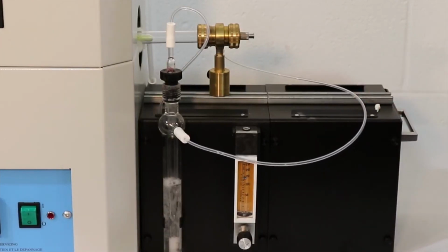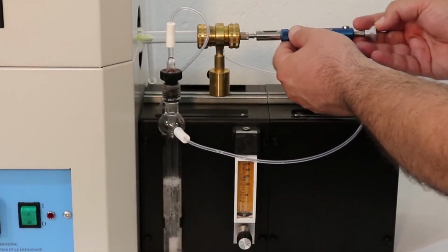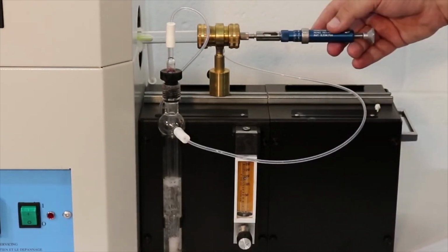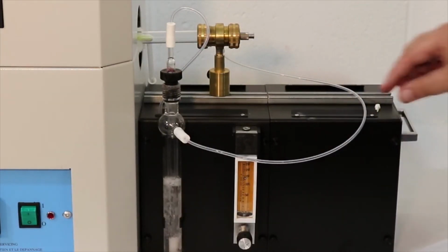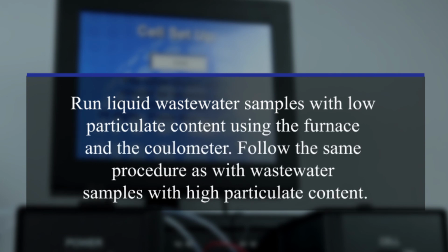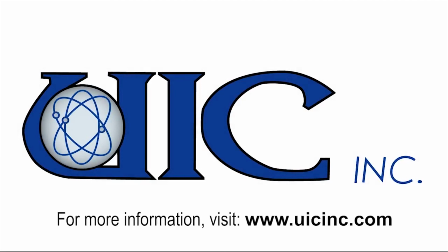Remove the white cap at the end of the breech block and insert the syringe. After purging, press the button on the syringe to release the sample. Take the syringe out and put back the white cap. If you would like to measure more samples, press Next. If you are finished, press Done.